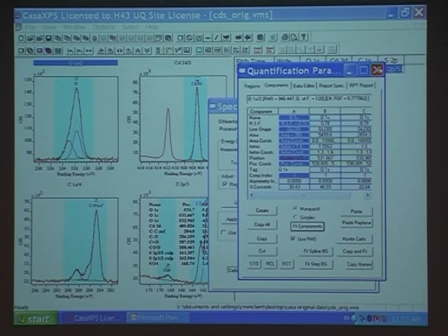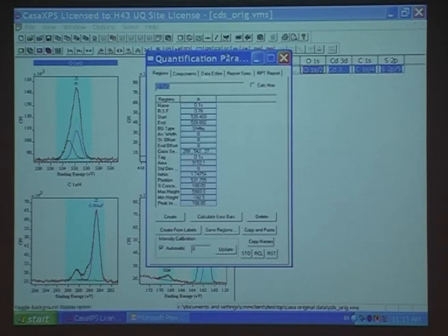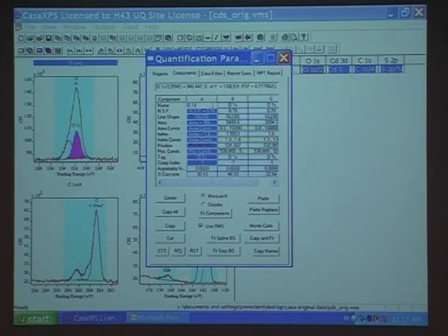And what did we end up with? We come into here. What do we got? 5.5, we got 1.4, nearly four times. So this oxygen, I can come in and say, right, I know what that oxygen is. So I come into here, go to the oxygen components. This is the oxygen XSO4.